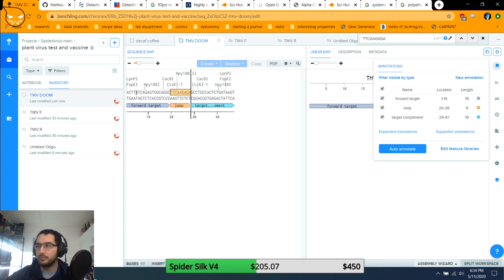But we still have a problem, which is, how do I actually make this? Because I can have the DNA company make me both halves of this: the coding strand and the complement strand, the top half and the bottom half, so it's two pieces of DNA that I would have to have them make. I can then just mix them in a tube, heat them up, cool them down, and they'll stick together. But now I've got a piece of DNA, and that doesn't really help me, because I really need this in RNA for this to work properly. So now the question is, how do I actually make the RNA? Because it's the RNA that I need, not DNA, but DNA is what I can buy.